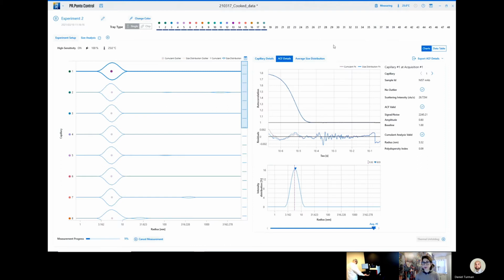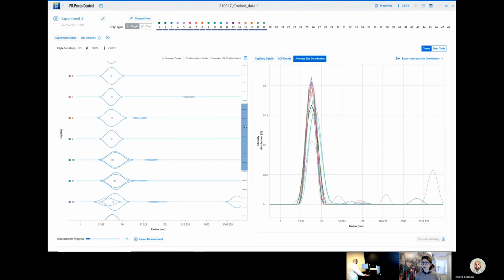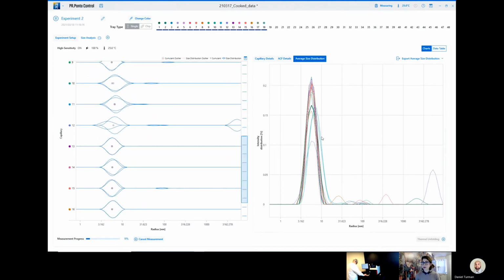Absolutely. And then your distributions would come from a different fit of each acquisition here. This is not only each acquisition, this is also every capillary. And what you will begin to see is that at high pH, the NIST mab is quite unhappy. And that's just a point to show you that even with samples that aren't perfect, you're going to get data which you can interpret here.